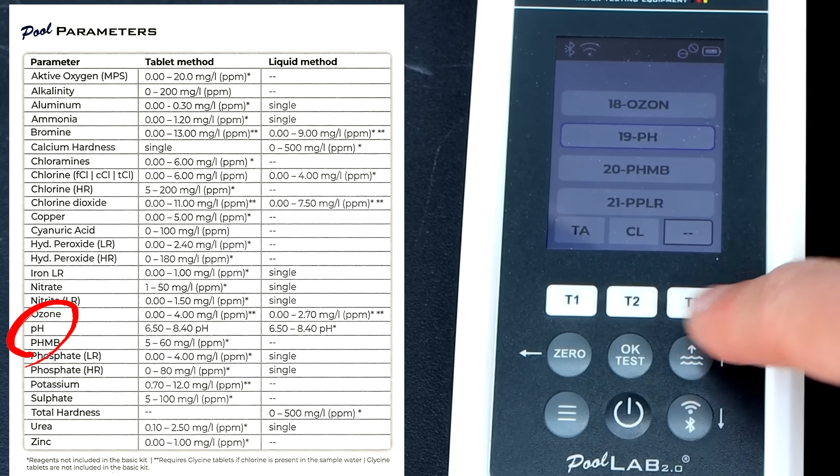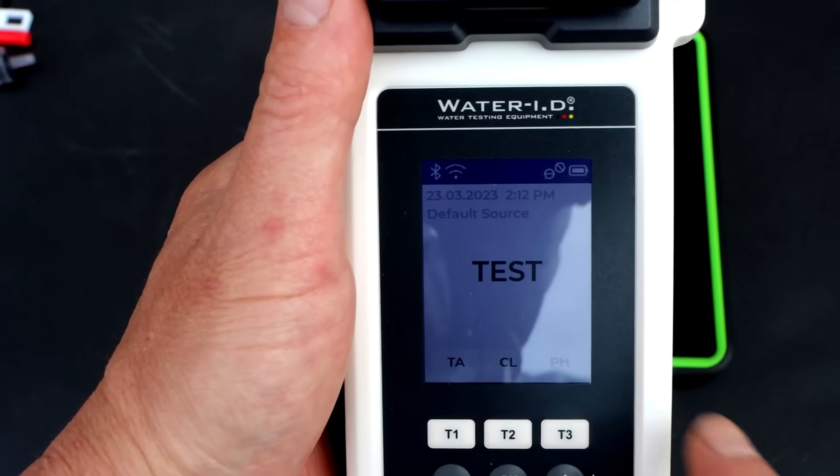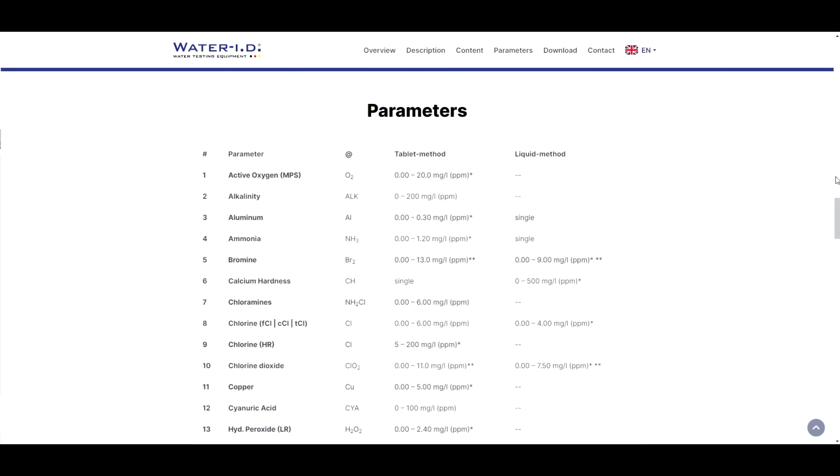You can see there are a lot of test factors available. I have total alkalinity, chlorine, and pH indicated at the bottom. There are some test parameters that you definitely would want to order the tablets for.